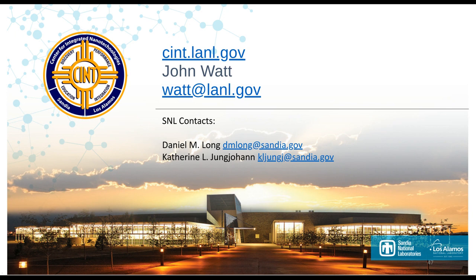And also, I guess the goal would be, as they start to build these training data sets on particles that have been resolved to high resolution, you can start to reduce some of the acquisition times that are needed, tens of thousands of images that are combined. Perhaps AI/ML can start to reduce the time with the microscope, which is obviously labor intensive and microscope intensive and costly.